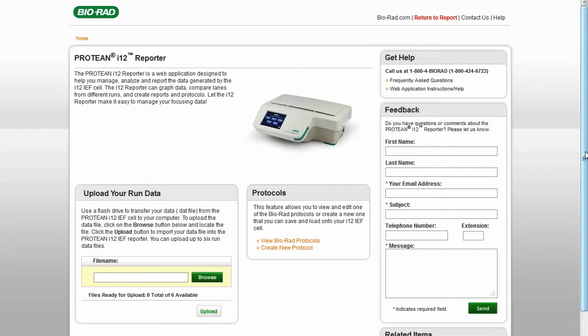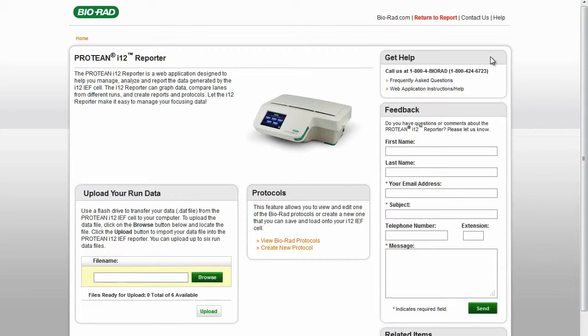Return to the Home screen for other resources. Get Help lists the contact number for Bio-Rad technical support, FAQs, and instructions for using the Protein I-12 Reporter web application.